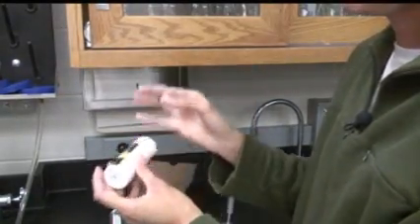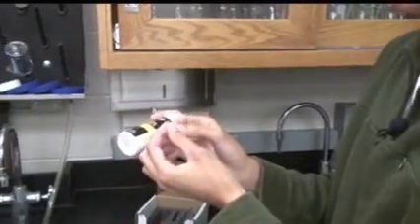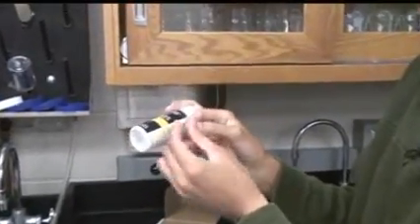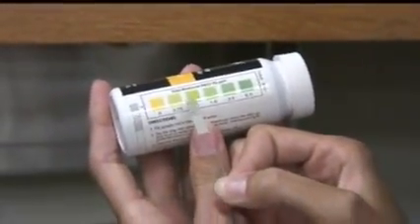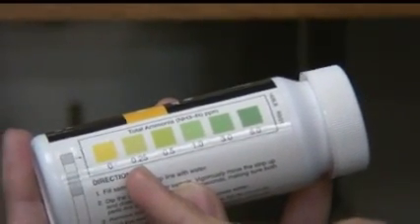In order to read the measurement, make sure that you are looking through the plastic at the back side of the pad. If you look closely, you can see the raised bump where the two pads are. Then flip it over and compare the sample color to the colors on the bottle. This sample would be 1.0 parts per million of ammonia. It's fairly common to get a lower level reading like 0.25 with distilled water on this test because ammonia is added as a preservative.